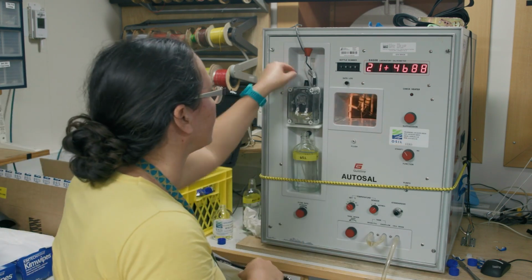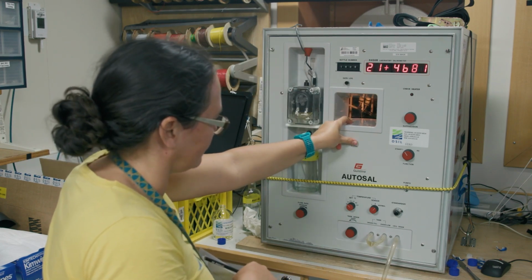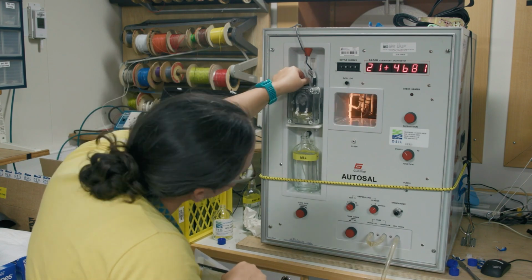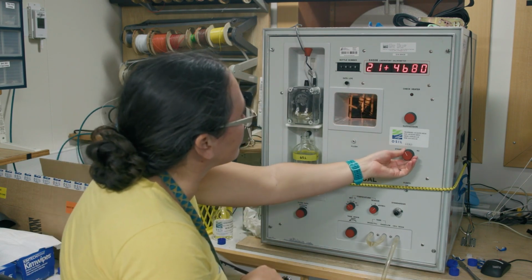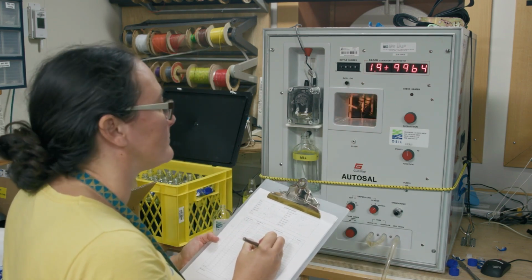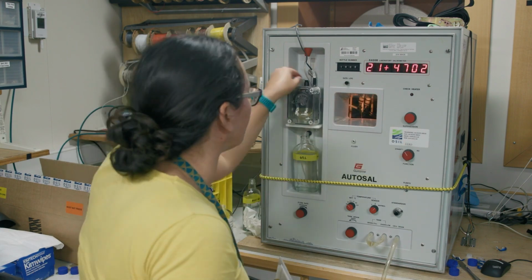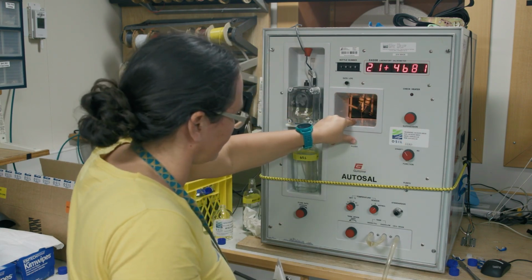Switch back to standby, turn on the peri pump, flush and fill the cell with a new volume from the same bottle. Turn off the peri pump, let the temperature stabilize, switch to read, let the display stabilize, and record as a second reading from this sample bottle. Switch back to standby and repeat this a third time to record the third value from this sample bottle.